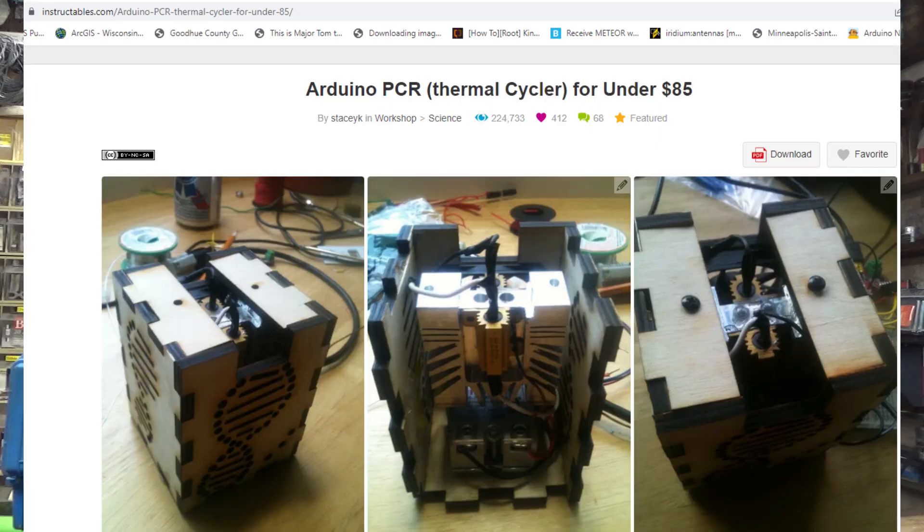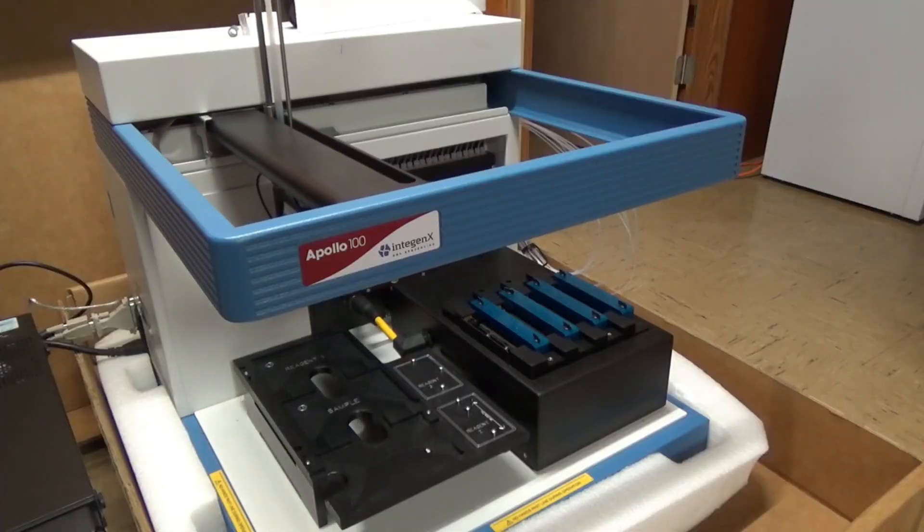This is a device from 2009, which to me seems like just yesterday, but is actually over a decade ago. Man, I feel old now. Anyway, science has moved on, and there are easier, cheaper, and more effective ways to get DNA information now. There are all-in-one DNA labs on Kickstarter, and there are homemade devices on Instructables, so you could probably do it a lot more easily than with this gigantic machine. My giant robot sequencer might be just as extinct as the dinosaurs.